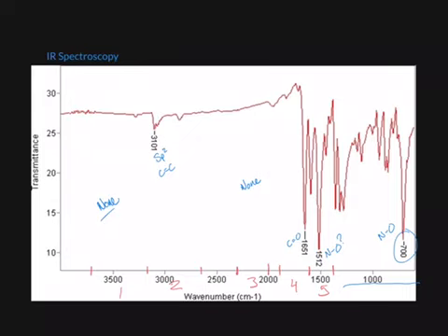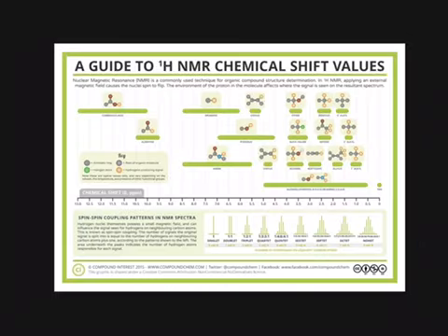Also, this line here, the start of the graph, is very, very low compared to normal. Usually it would be above 30 or so. Now, this is an indication of aromatic rings, and symmetry will also do this. So we know that our molecule more than likely has some symmetry, and it's probable that we have rings in there, which we also found out from our mass spec earlier.